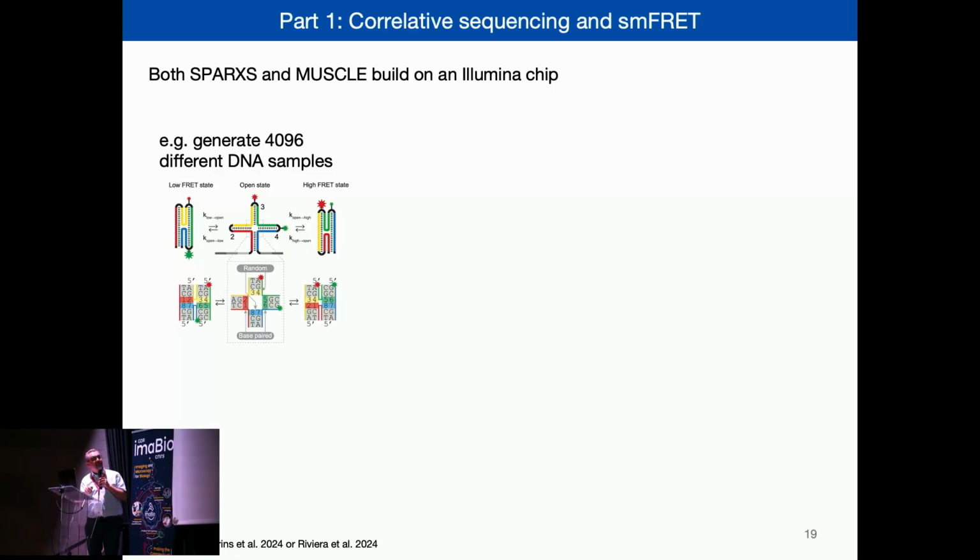These are very similar, and both are building on the same Illumina chip. And the concepts are very, very similar when you read both papers that came out last year. You see that, yeah, they are independent, but also not so independent if you think about what they designed. So I show interchangeable figures from one or the other paper.